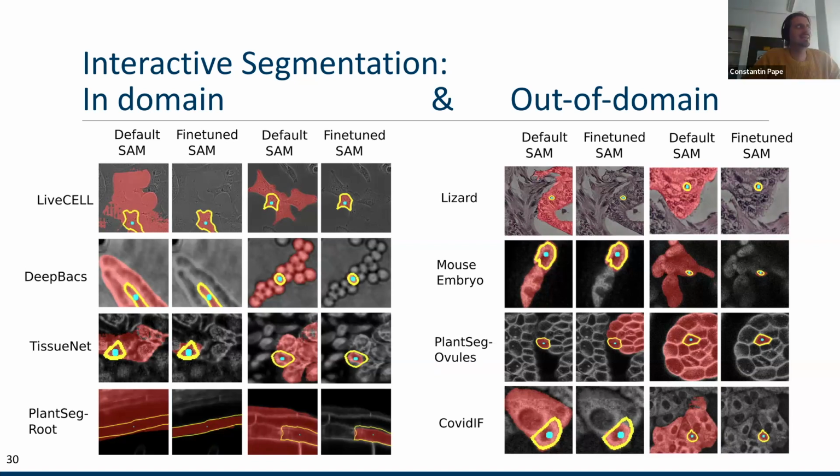Live cell really has some non-convex things. Also, the bacteria dataset has quite stringy objects. If it's just a single stringy object, it can actually work quite nicely, especially after fine-tuning on it. If you have something more complicated, like a network of fibers or strings, then even fine-tuning won't really work well, especially if you have 3D structures. That's our experience.